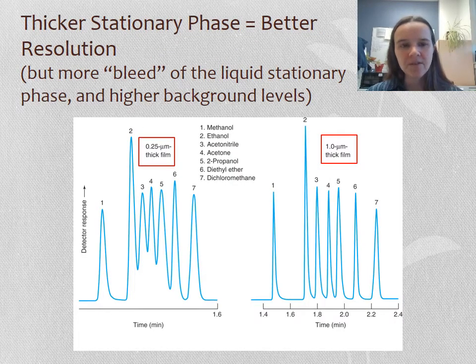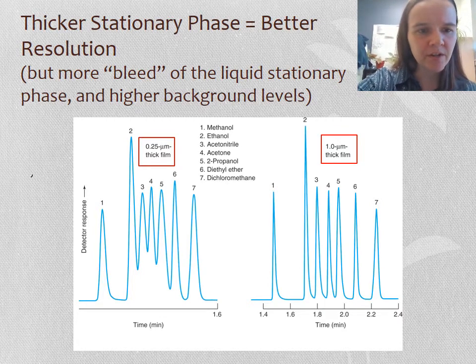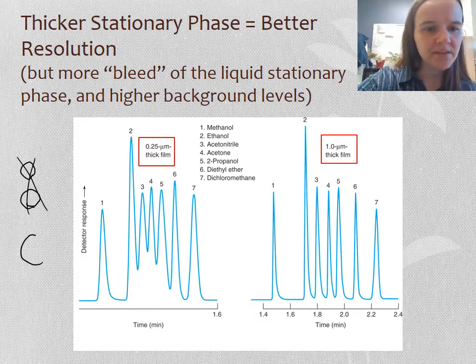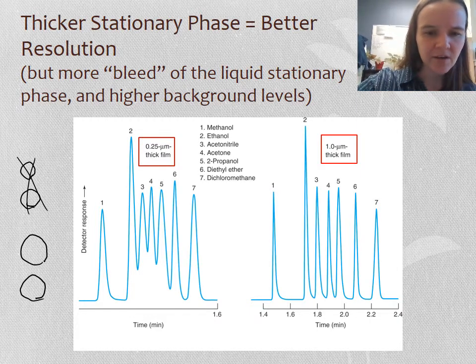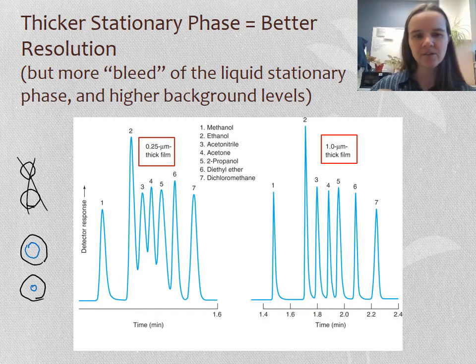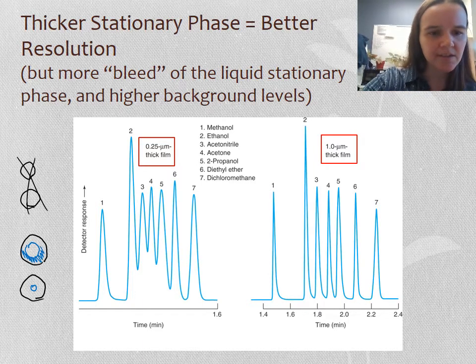Now in GC, you've got that stationary phase. And so this is not the diameter of the column. A moment ago, I talked about diameter, big diameter versus thin diameter. It's not that. What this is, if you had equal diameter ones, is how thick the coating is. And so you've got that well-coated open tubular column, which is like that. Okay? This is drastically exaggerated, but the coating is on the inside.